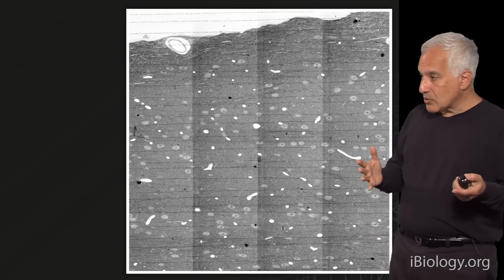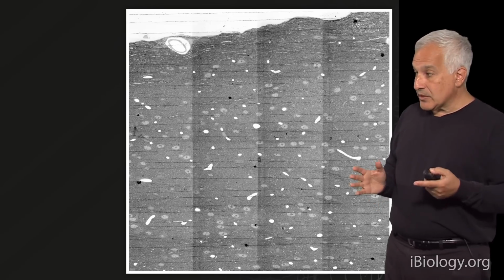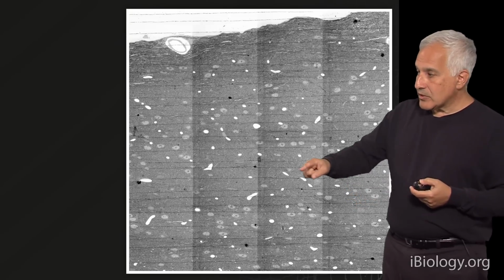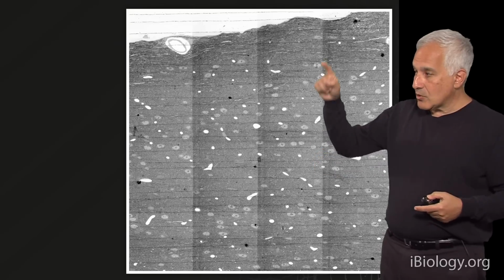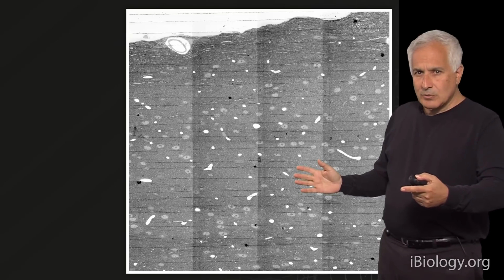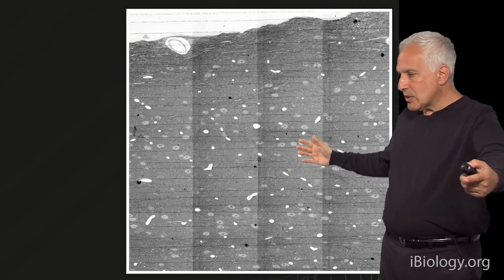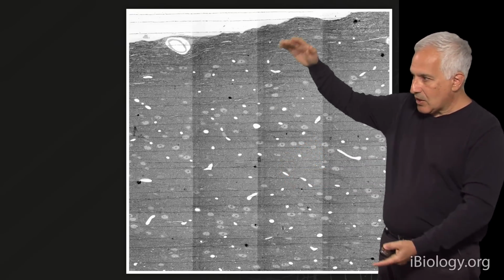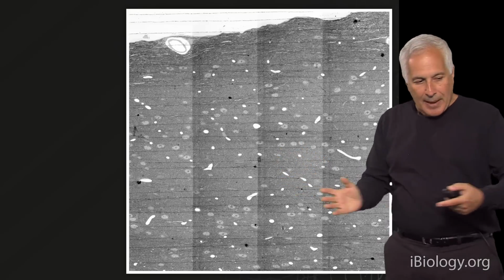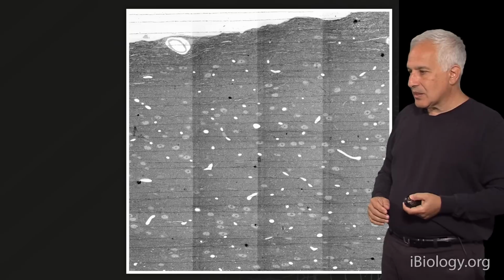So here is that section at 4 nanometers resolution. Doesn't look very impressive. It looks sort of like what I showed you before, but this is clearly not the full size image. This is the whole data set, but in fact, at 4 nanometers resolution, it's 100,000 pixels from left to right and 100,000 pixels from top to bottom. This screen is about 1,000 pixels wide, roughly in that range. So this image is actually 100 times larger than the picture you're looking at, and 100 times taller and wider. In fact, to see the whole picture, you'd have to back up so far it would look like this again. So I can't show you the entire data set at once.